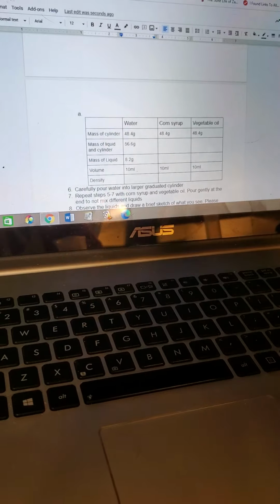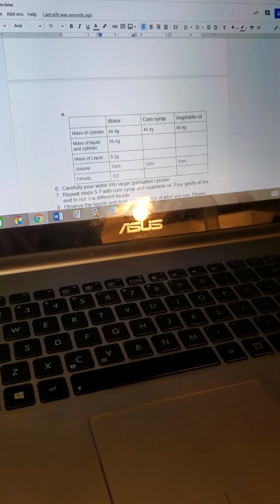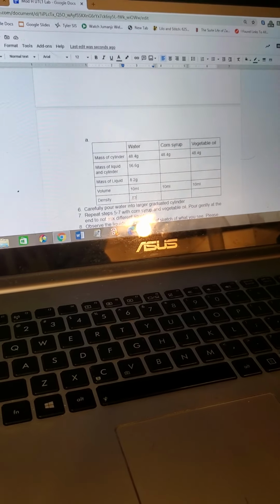What you should get is 0.82. Alrighty, so now I'm going to pause the video and we're going to continue with corn syrup.